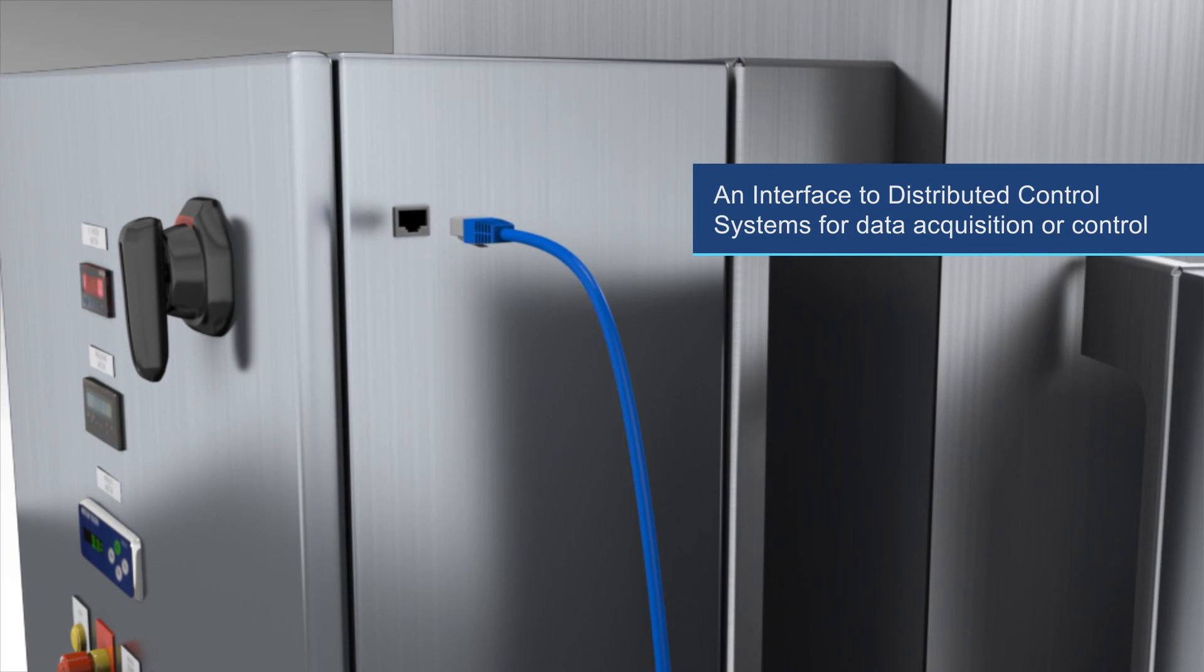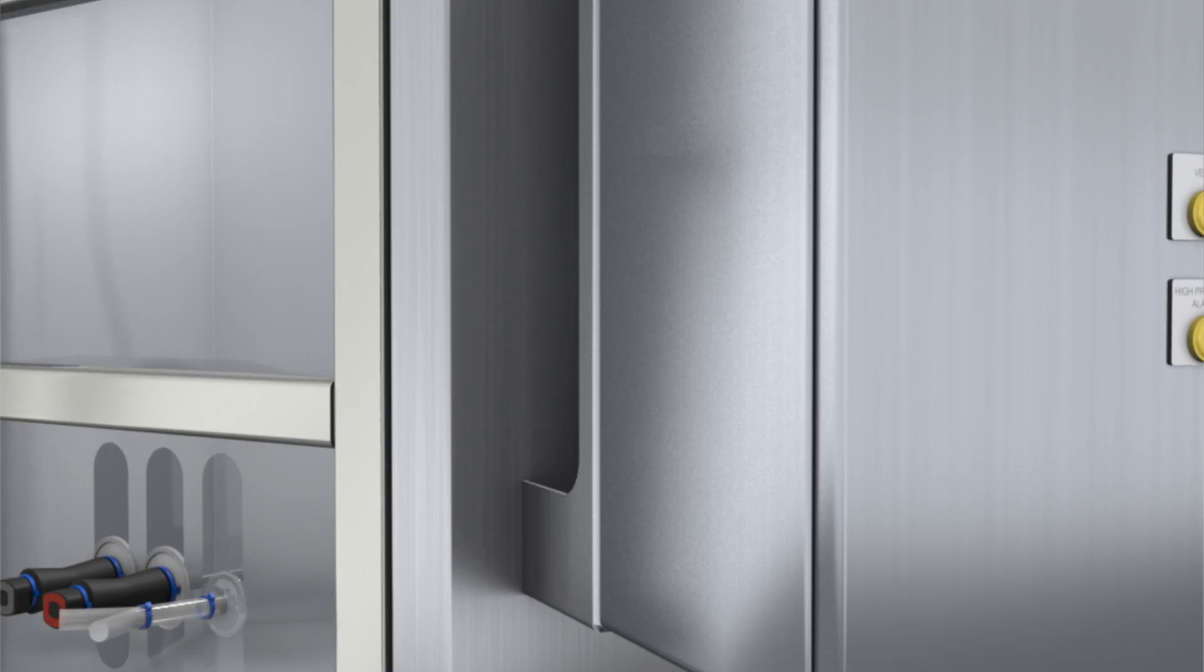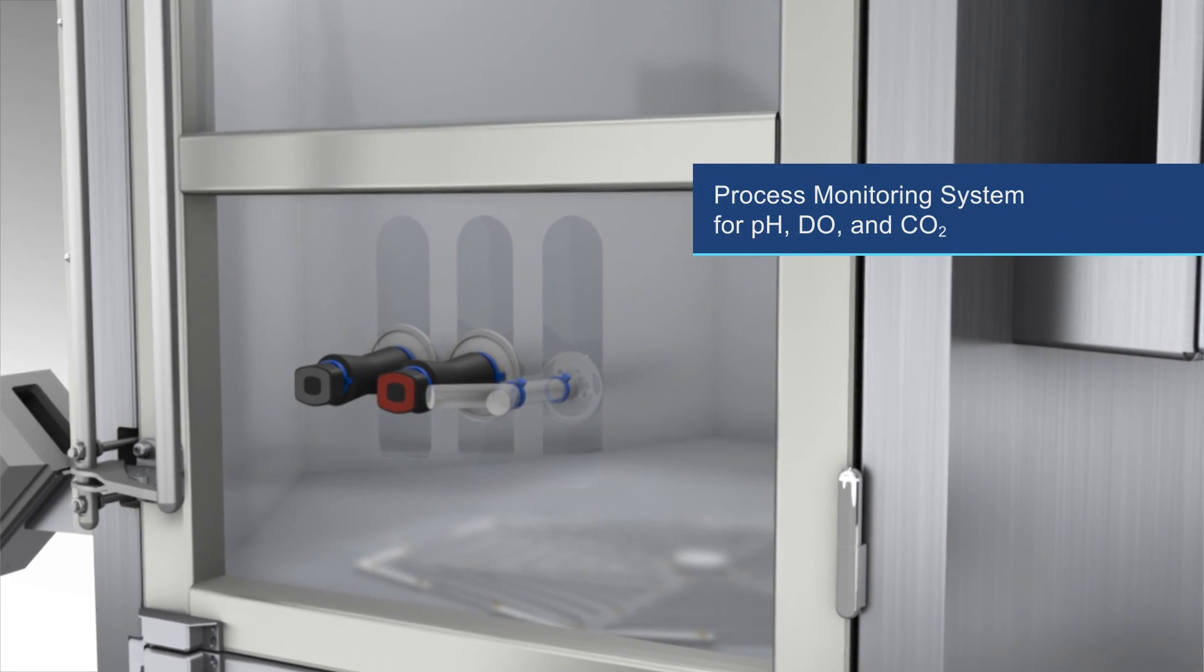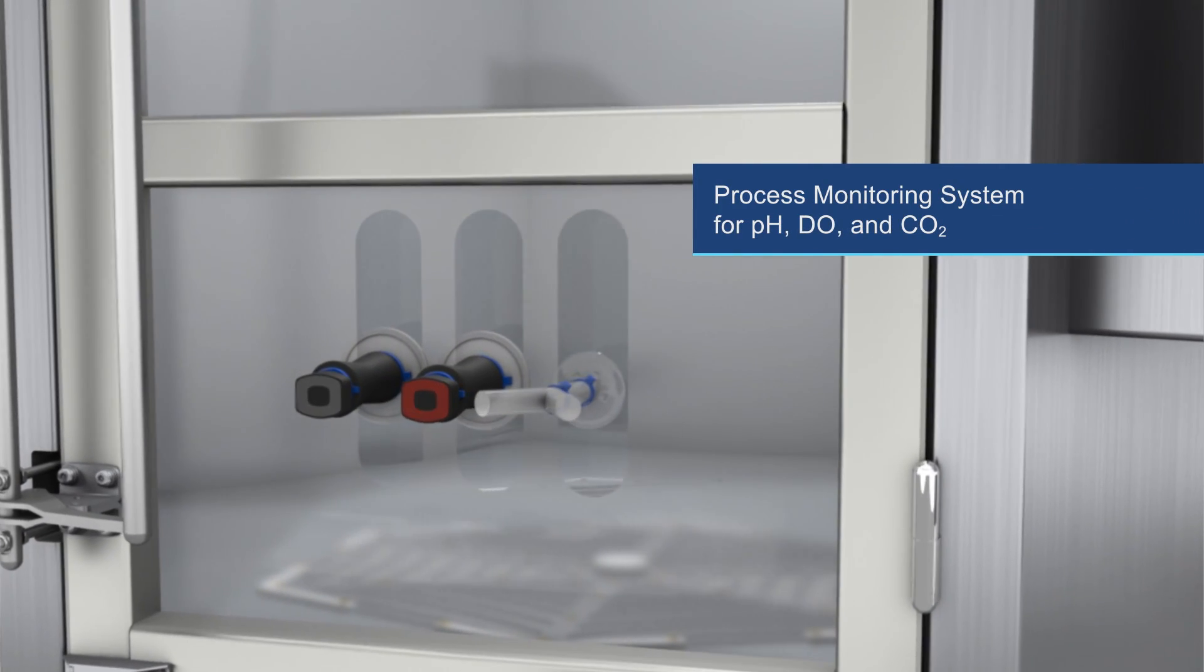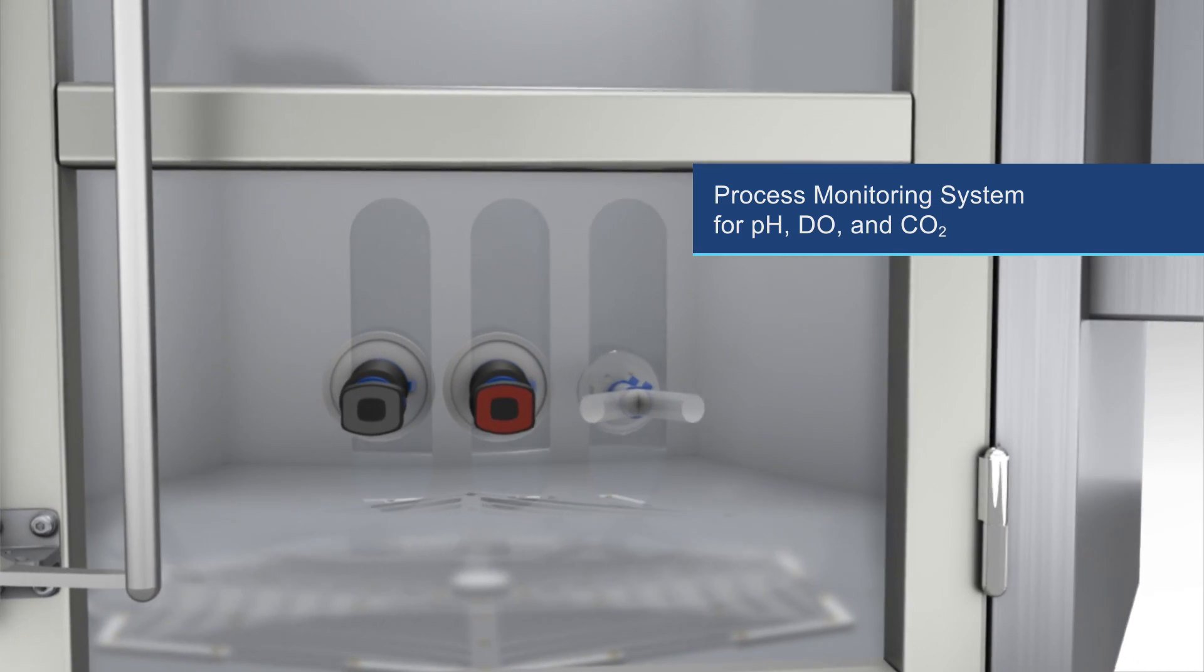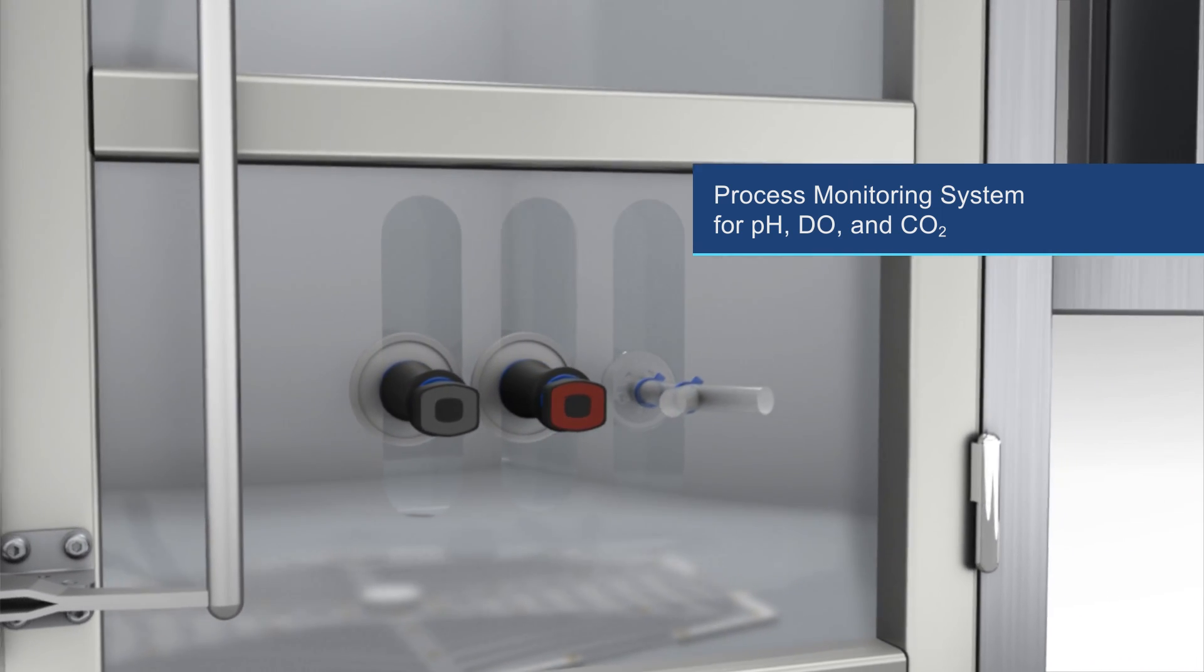An interface to distributed control systems for data acquisition or control. A process monitoring system for pH, dissolved oxygen, and CO2, which accommodates reusable or single-use probes.